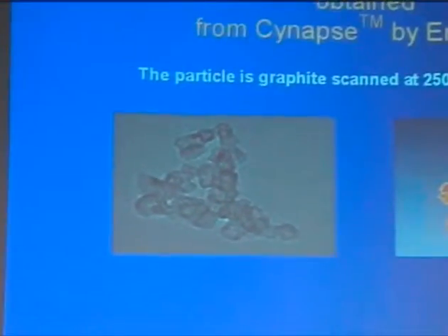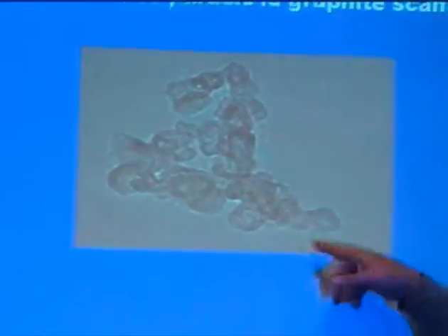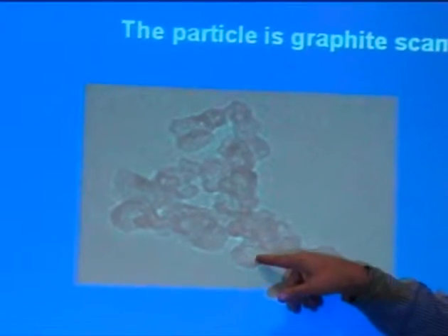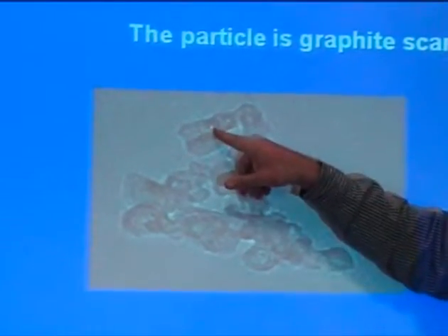What happened, let me go back. Here's an example of a slice. This would be a TEM scan, which is focused at a certain plane. In this focal plane, you can see I've got material here, there's a hole right there, material here, there's the top. There's another little hole here. There might be some other holes. So what you do is the software changes the focal length through the material and gives you slices.